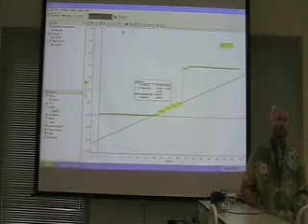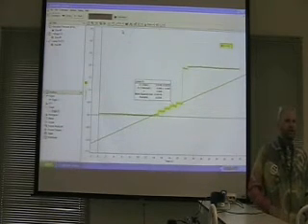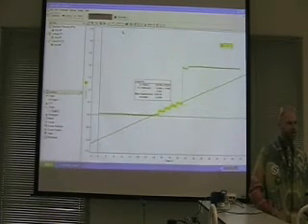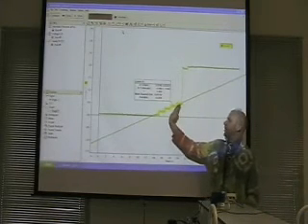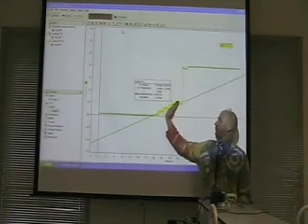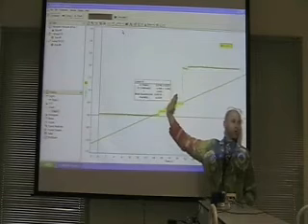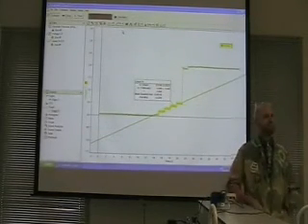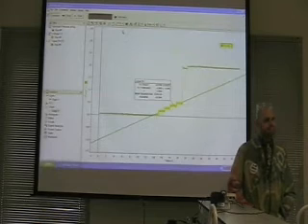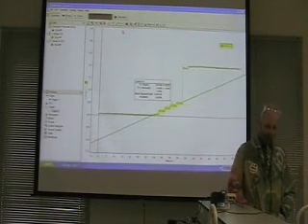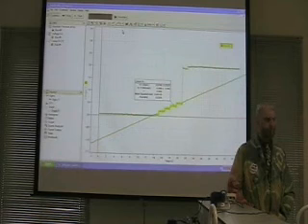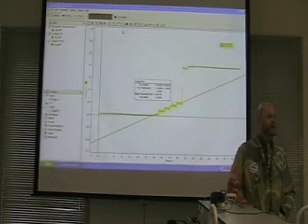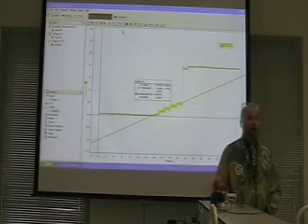And of course if you have the reaction go faster, that slope can be higher, and if the reaction goes slower, that slope can be lower. So is there a thing for degree? Oh, it's good to see this look, absolutely, with another circuit.